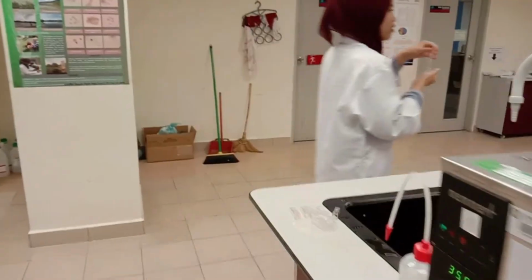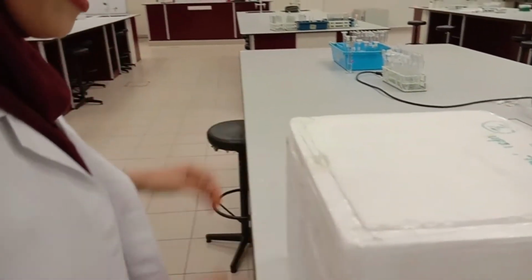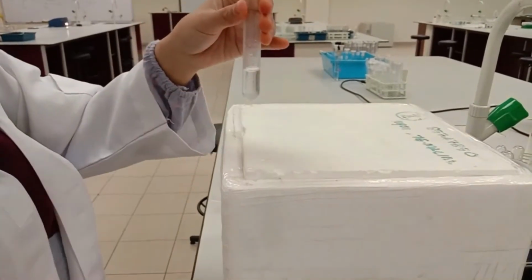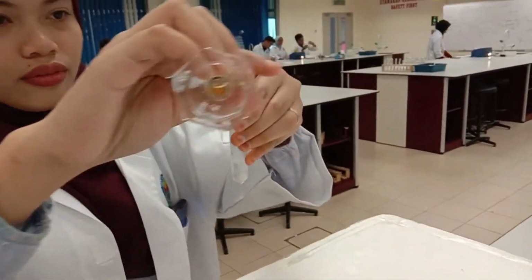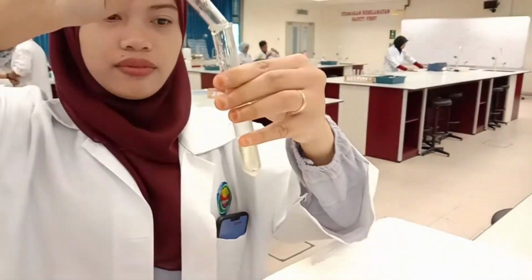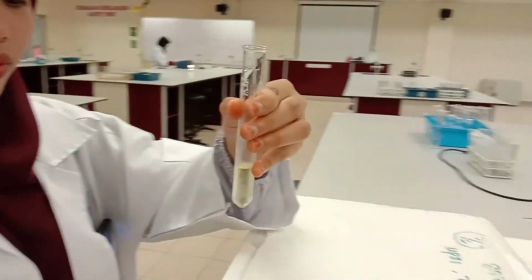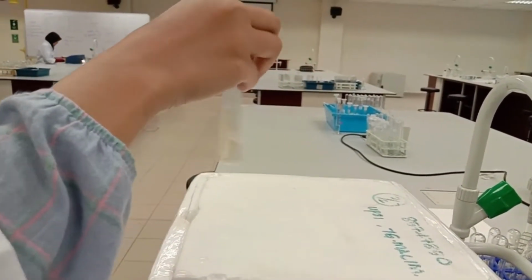After 10 minutes, the mixture was taken out from the incubator and placed into an ice bath. After that, 1 milliliter of iodine was added into the mixture and shaken. Absorbance was measured.